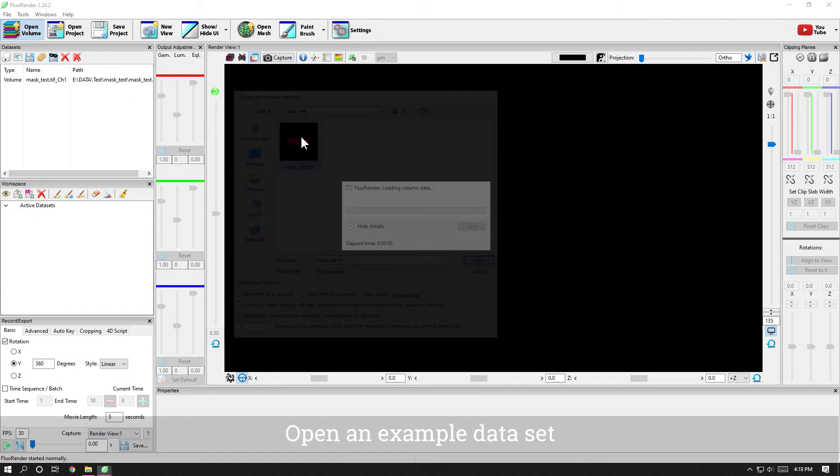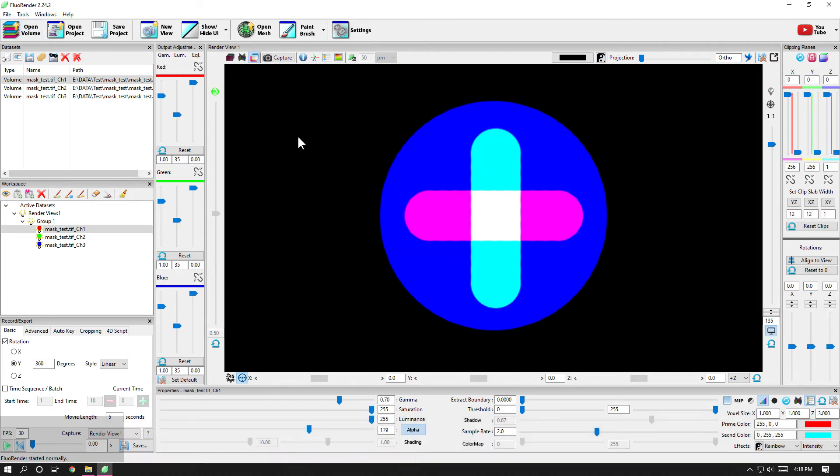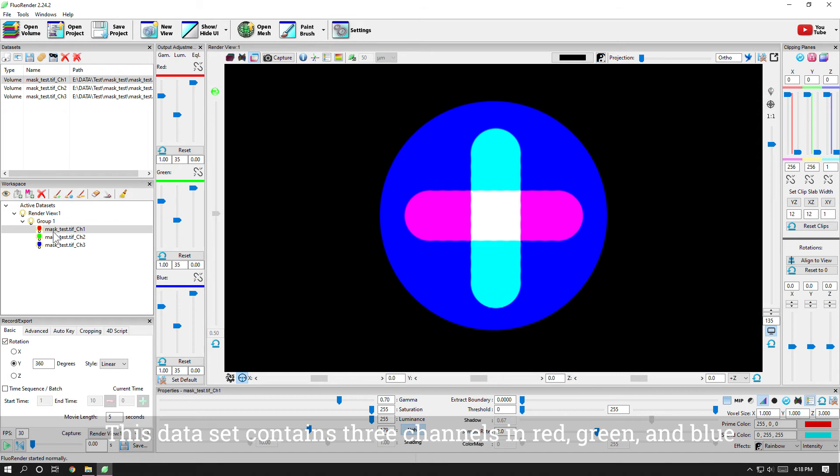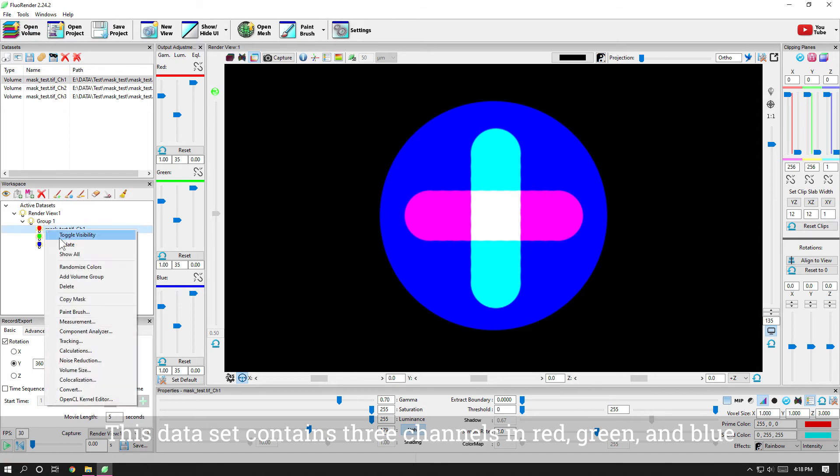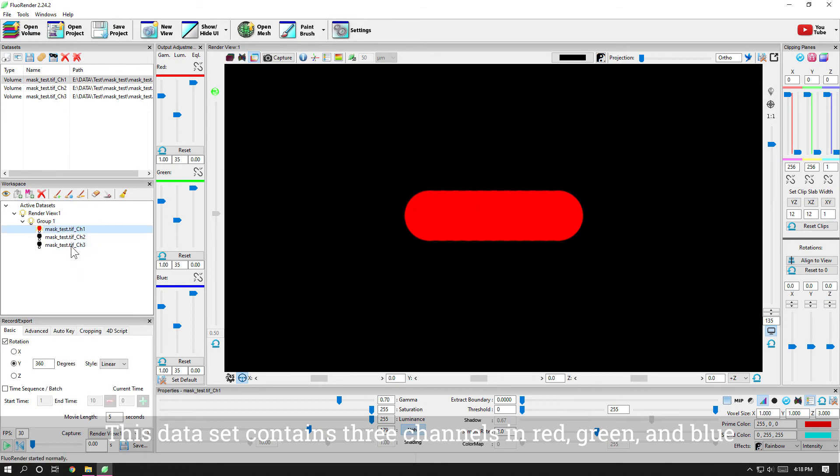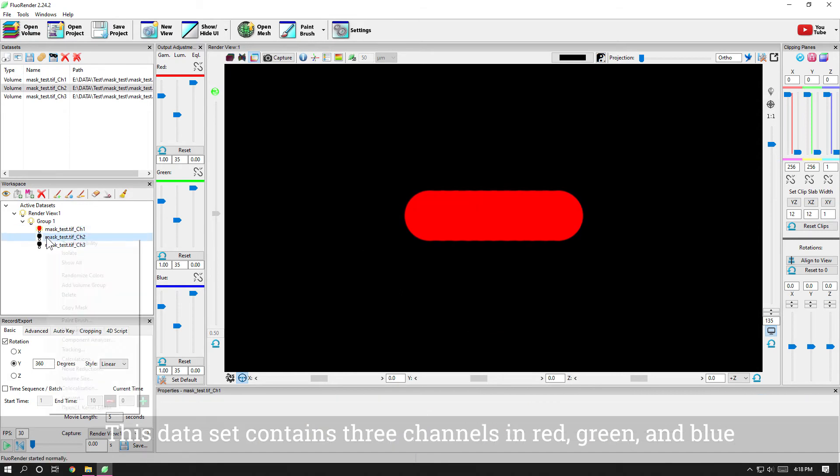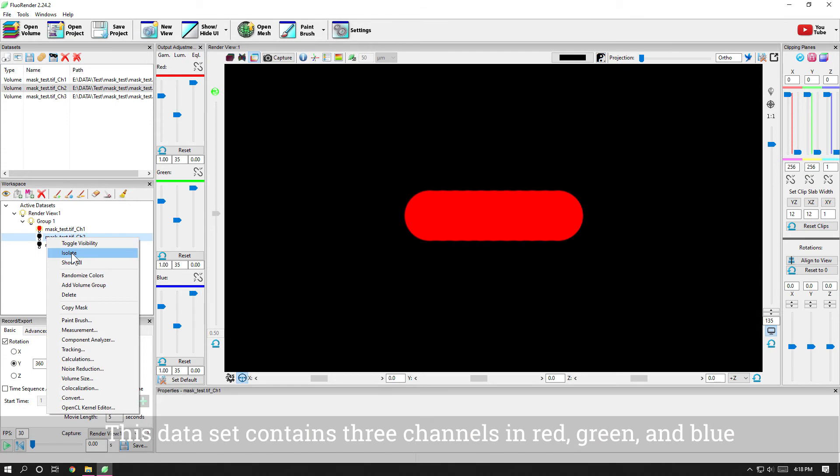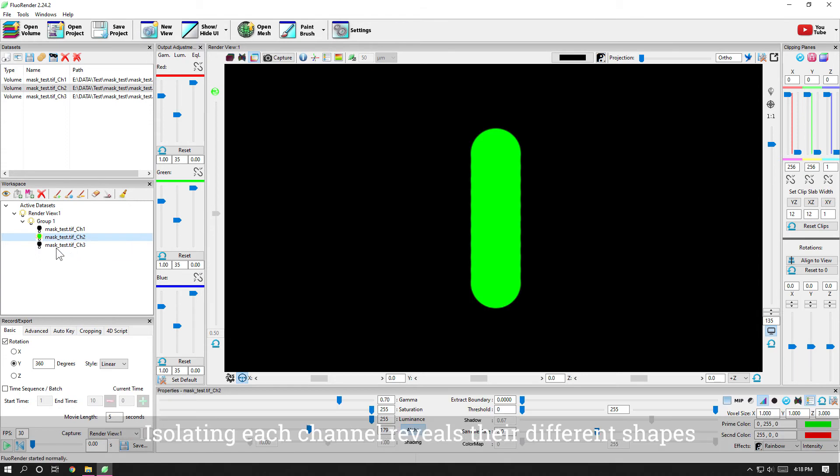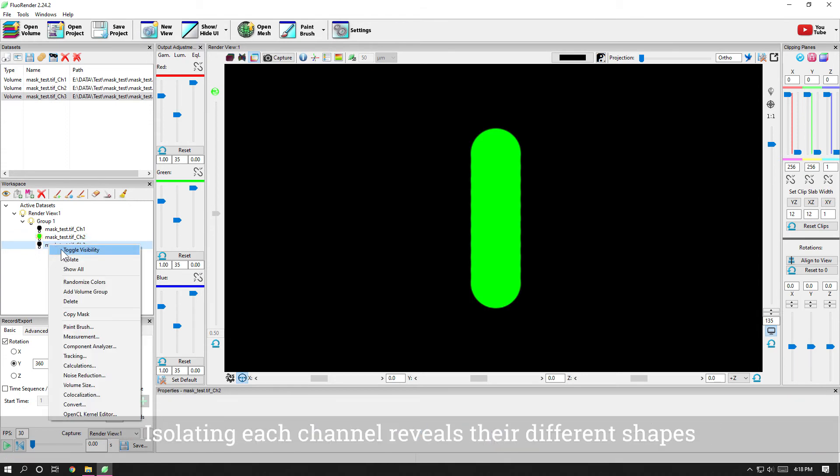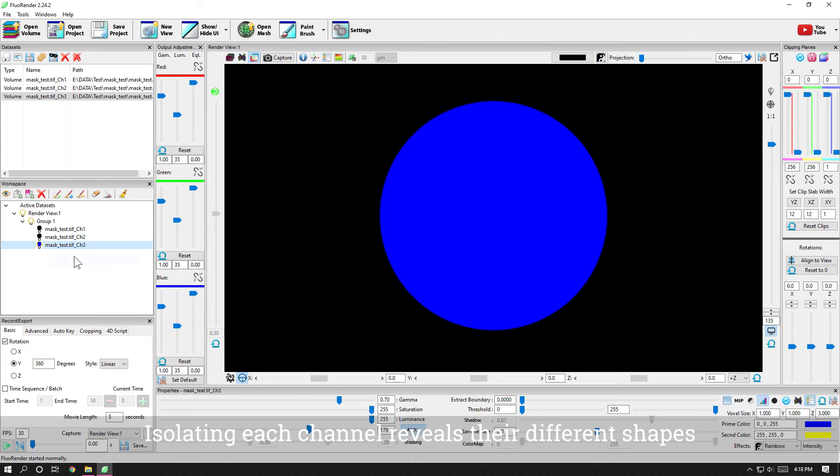Open an example data set. This data set contains three channels in red, green, and blue. Isolating each channel reveals their different shapes.